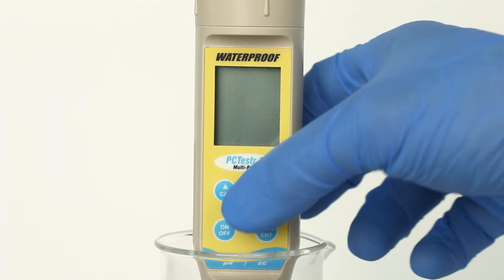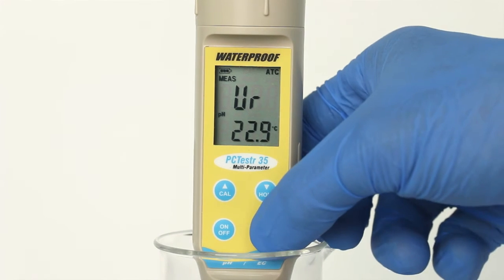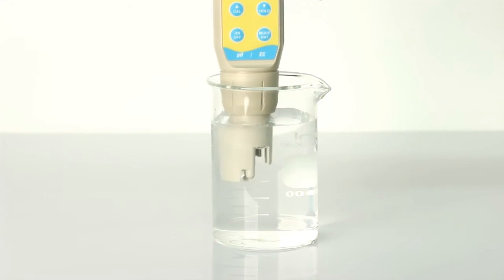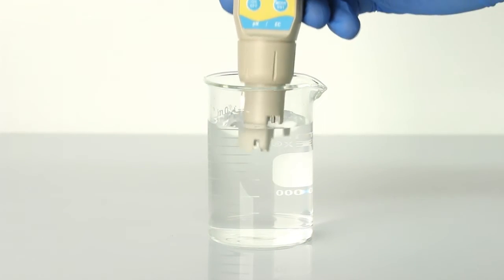For best results, calibrate with certified accurate conductivity calibration standards. Press ON-OFF to turn the meter on and MODE ENTER to select conductivity mode as needed. Rinse the sensor with clean water, then immerse the sensor into your standard and press CAL.